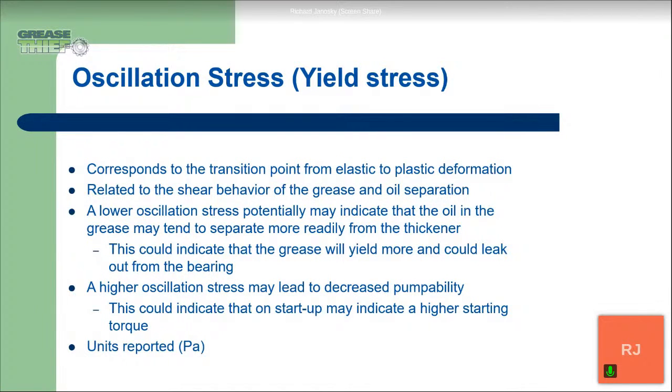If we had a higher oscillation stress, it could lead to decreased pumpability, and this could indicate that on startup, it may require a higher starting torque to get everything going. This one is also reported in the same units of pascals.